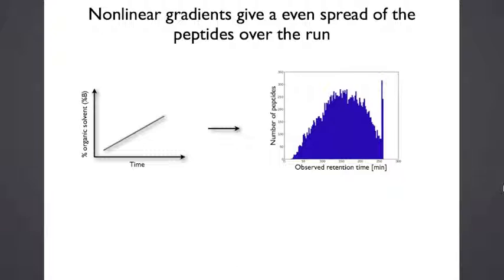I'll just go through the basic ideas of using nonlinear gradients, and then I will explain step by step how you can calculate such a gradient if you have a certain retention time distribution of interest.